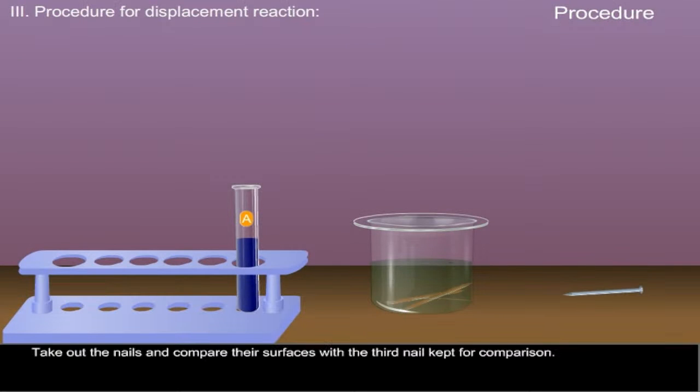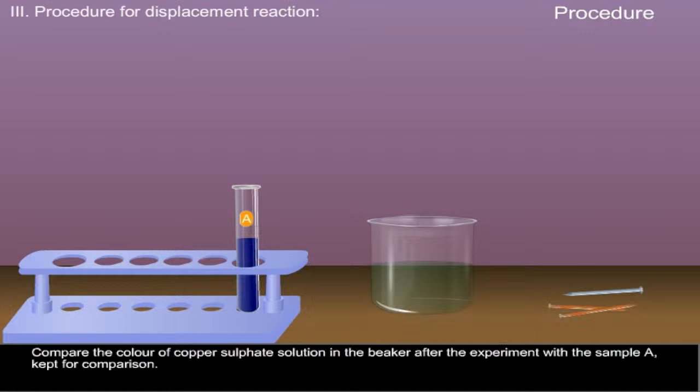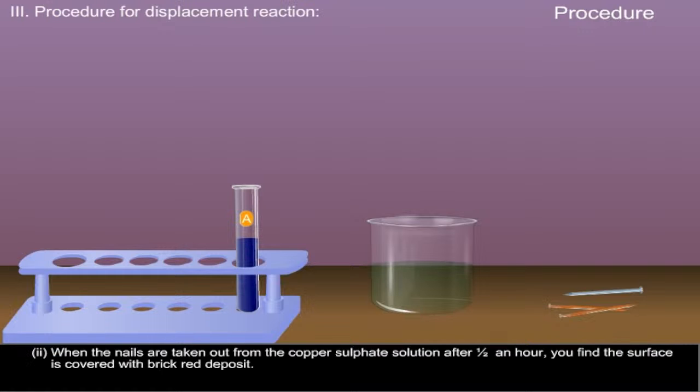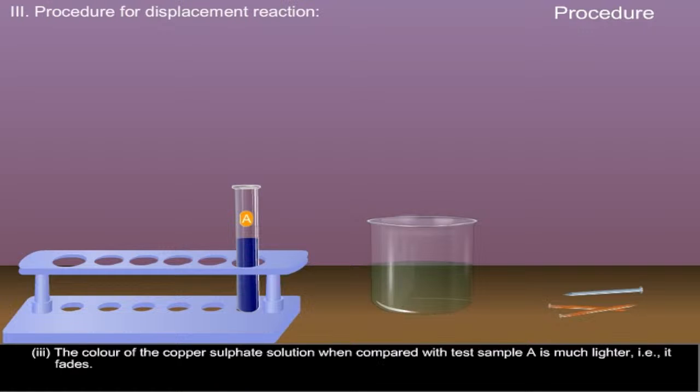After half an hour, take out the nails and compare their surfaces with the third nail kept for comparison. Compare the color of copper sulfate solution in the beaker after the experiment with the sample A kept for comparison. Observations. To start with, copper sulfate solution is blue in color and all the nails are silvery gray in color. When the nails are taken out from the copper sulfate solution after half an hour, you find the surface is covered with brick red deposit. The color of the copper sulfate solution when compared with test sample A is much lighter, that is, it fades.